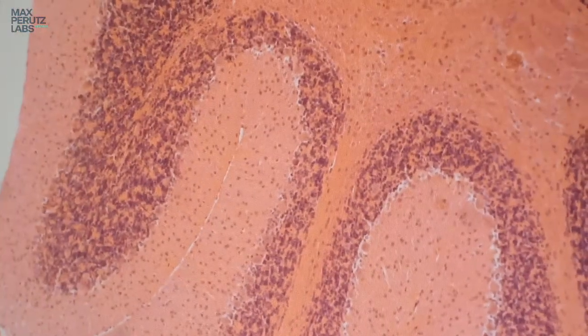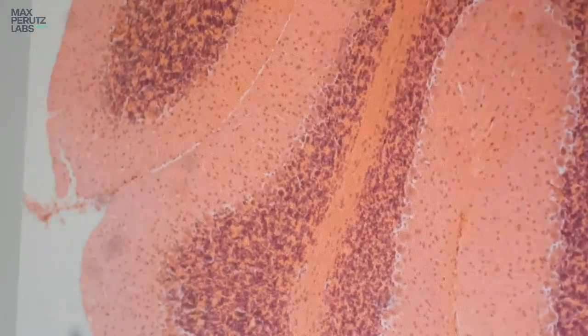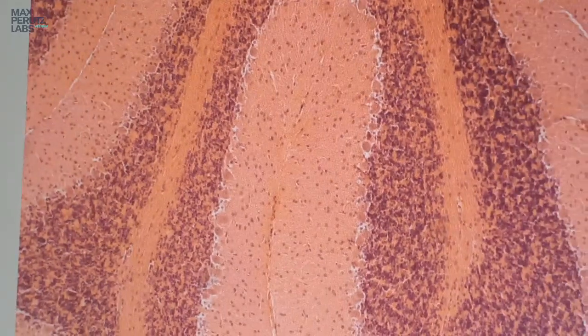What you see here is hematoxylin-eosin stained small brain section. You see nuclei in blue and cytoplasm in shades of pink. One can say the histology lab is small but most versatile to meet as many requirements of our users as possible.